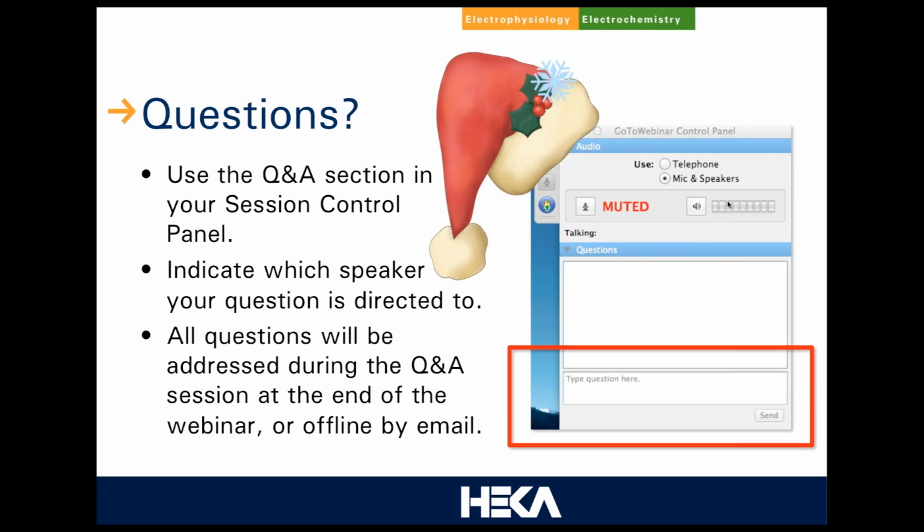In terms of when to do C-slow, typically, I would assume that you want to start compensating first for C-fast, making all the electrode capacitance transients neutralized before you do C-slow. That would be probably a good time.